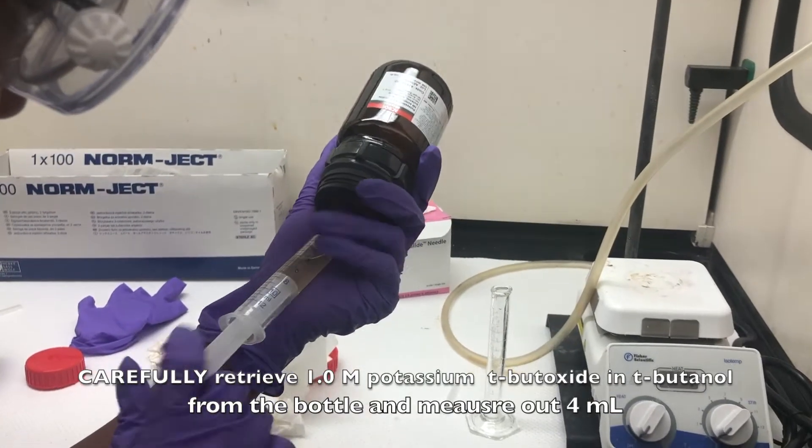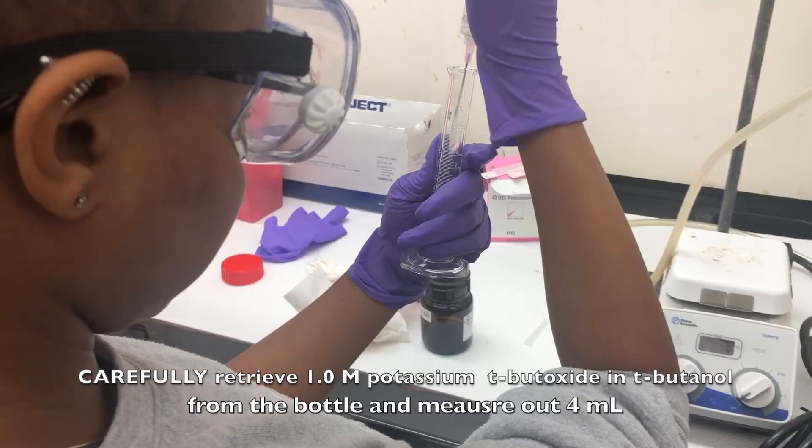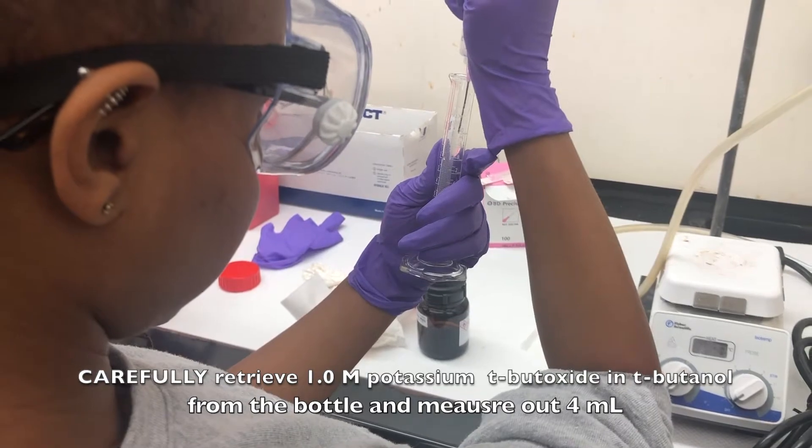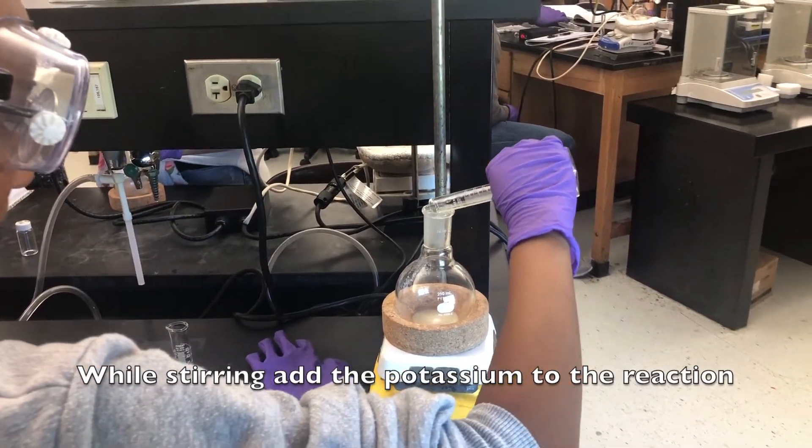Carefully retrieve one molar potassium from the bottle, and then measure out four milliliters of potassium in total. While stirring, add the potassium to the reaction.